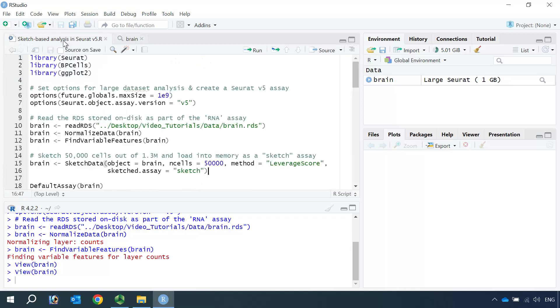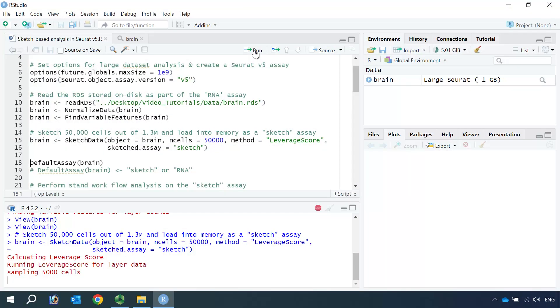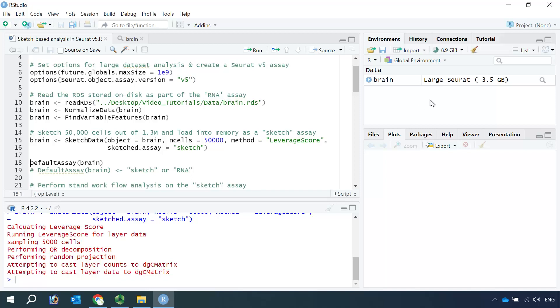Seurat v5 has a function called SketchData. We can use this function to subsample cells from a large dataset, while the matrix data is stored on disk. After cell sketching, the subsampled cells can be stored in memory for interactive and rapid analysis. So let's sketch 50,000 cells from the 1.3 million mouse brain cells. Then we can perform the standard workflow analysis using the sketched data. Okay, it is done. We can have a look at the object again.